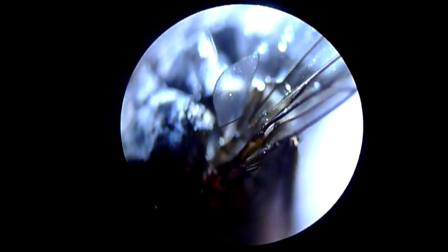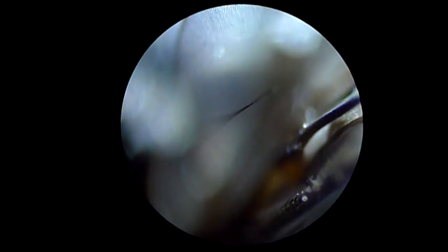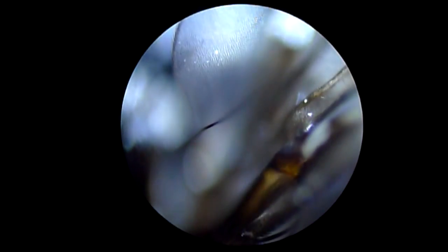We'll go in a little bit more. You can just see the sheer size of what we're looking at now. We'll move the whole tripod then. That's not a good procedure. I don't know what I'm looking at now. Let's bring this, probably a bit of the wing here. Everything looks so alien. All the hairs. I'll actually make a good photo if I stacked it.